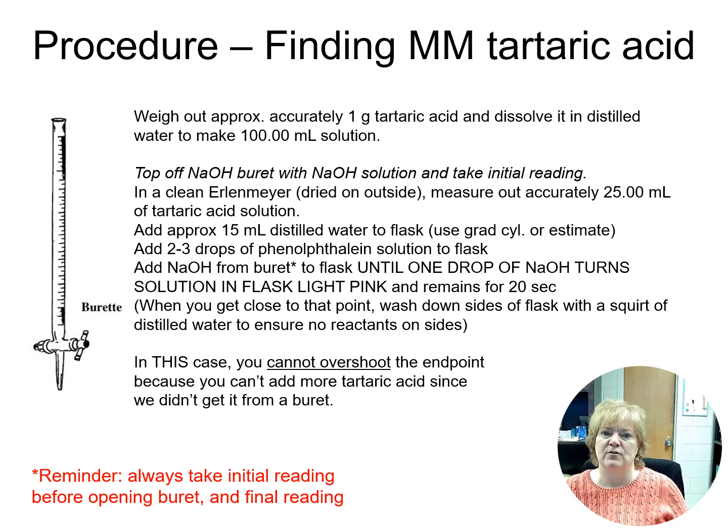However, know that you're probably not going to get, with precision, all four 25 milliliter portions out of that 100 milliliters. By the time you take the pipette out the first, the second, the third, the fourth one, usually it's a little bit short. You can't get all the way out. So you really only have enough for 3 titrations. Not a problem. You can either go a little bit light on the first one or just make a second batch of solution.